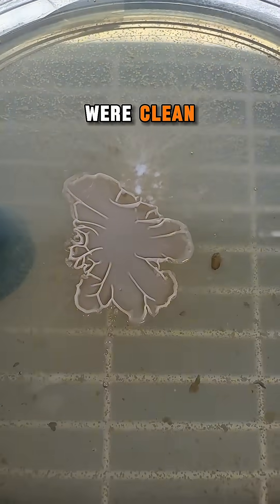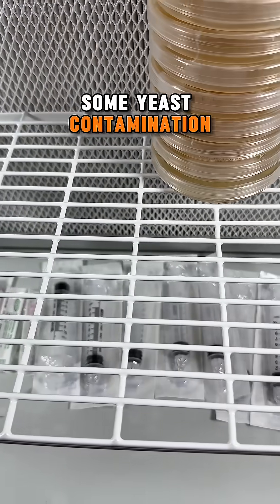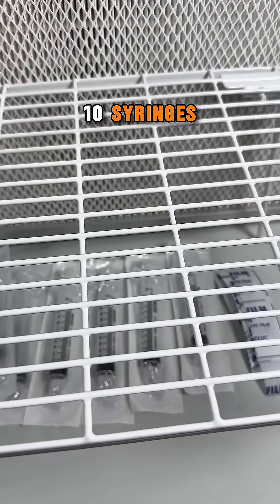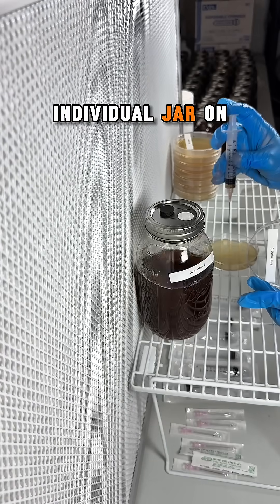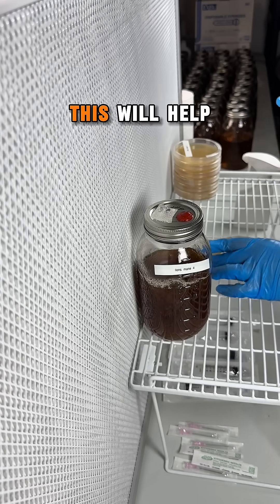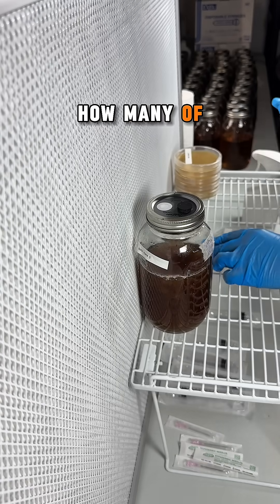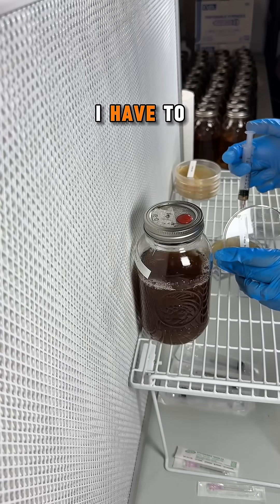If the results were clean, all of the jars would be good to go, but it looks like there was some yeast contamination. So now I have to use 10 syringes, 10 agar plates, and 10 needles to test each individual jar on its own agar plate to weed out which one was contaminated. This will help me figure out how many of the 10 jars I can keep and how many I have to toss out.